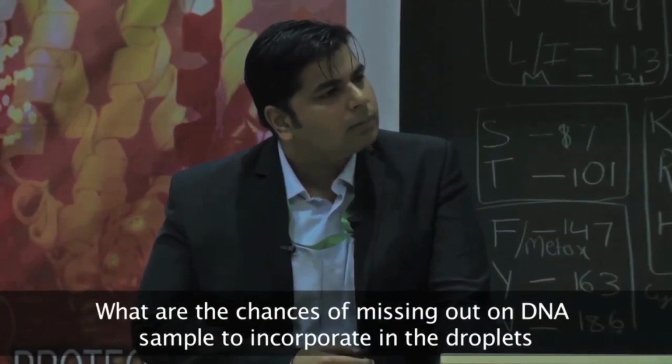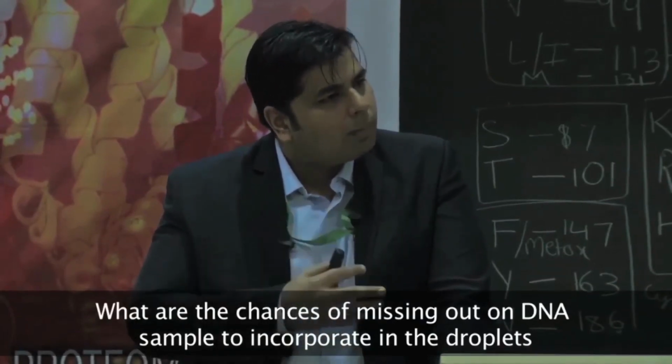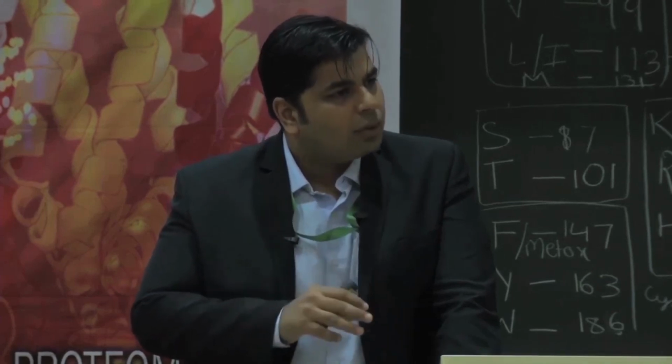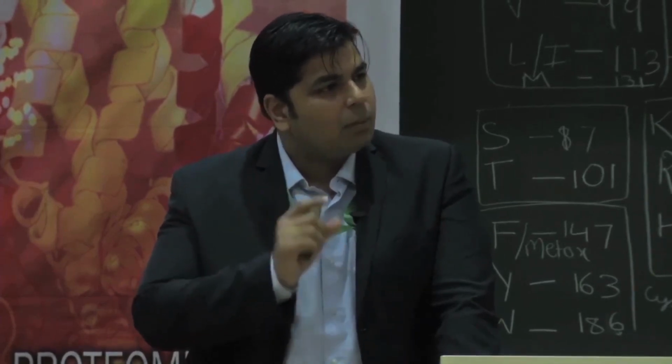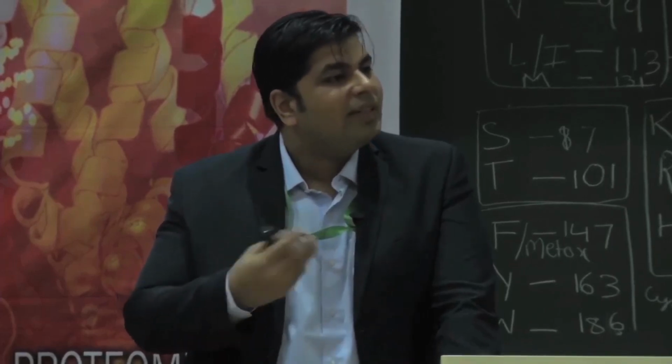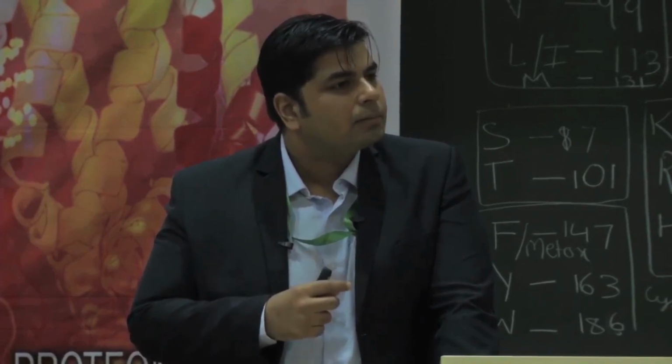Right, correct. But the technology is made in such a way that in the transfer of droplets, none of your DNA molecules are left behind. The technology makes sure that all of your reaction mix components are split up and are present in the droplets. None of it is left behind in the cartridge. The system is that rigid. It doesn't leave anything behind in the cartridge.